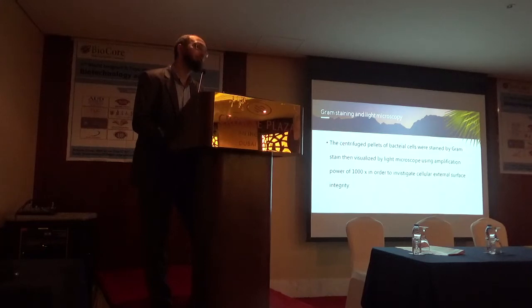And we also confirmed the integrity of the external surface of cells by Gram staining and light microscope, to confirm that cells are not degraded. Okay?